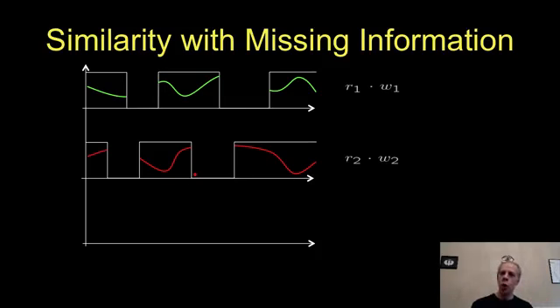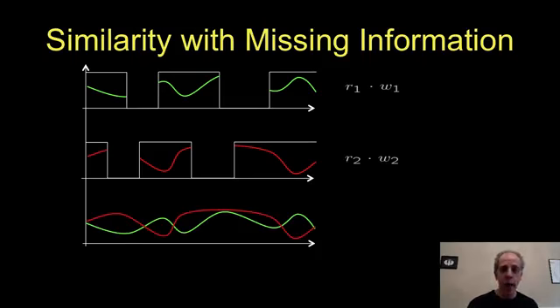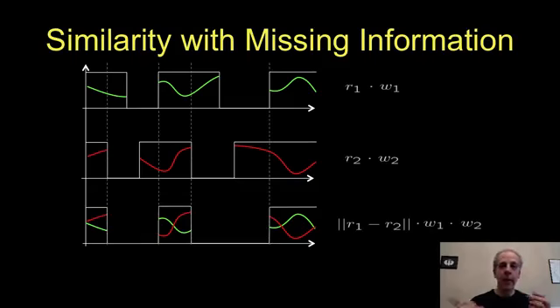Now you actually know where the missing wedge is, or you can guess it. Either you know from the instrument, or you guess it because there is a lack of signal to noise there. And these are the two images that we need to decide a distance between. We wish to have them complete, but we only have portions of them. And the only place where we can compare them is when we have portions of both. Here we had information for the first one, but no information for the second one. Here we had for the second one, not for the first one. So the only place where we can compare is when we have information for both of them.